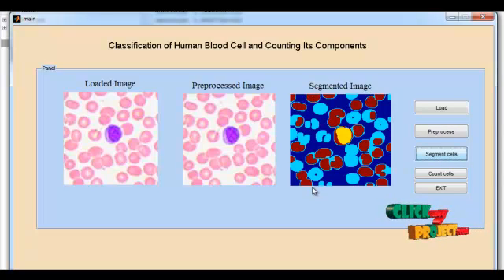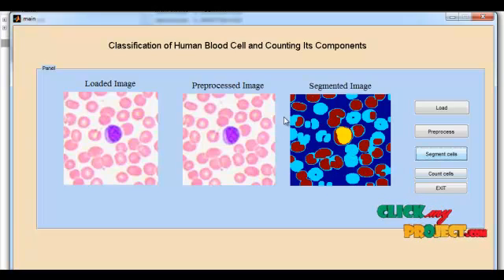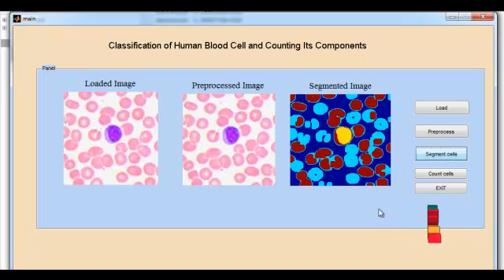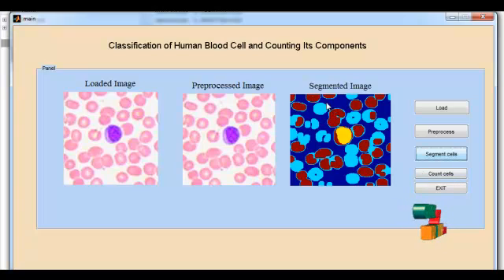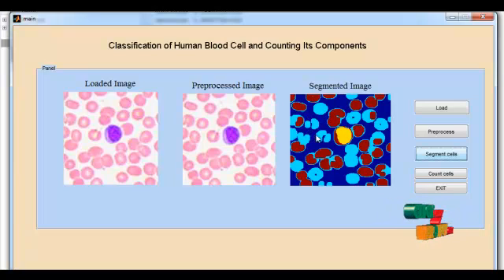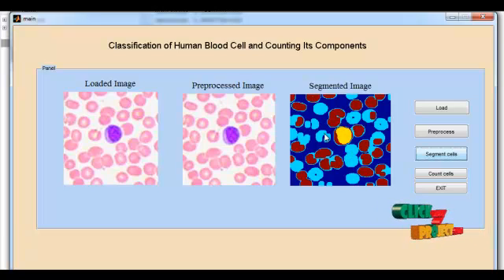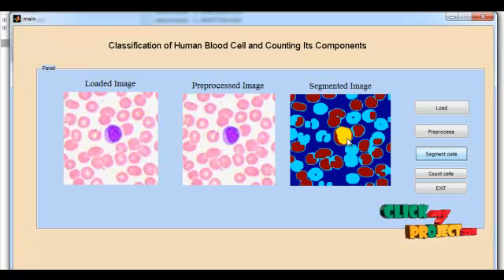Then performing the segmentation: the K-Means clustering clusters the colors into four types. These four types of colors are displayed. After pressing the Blood Count Cells button, boundaries are set for each color — blue color boundaries, red color boundaries, and yellow color boundaries — based on the threshold value. It clusters the image based on size and color.